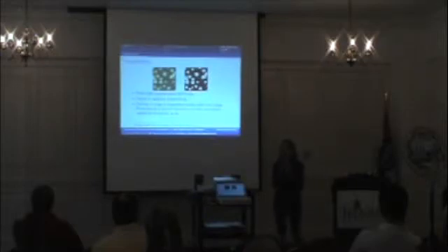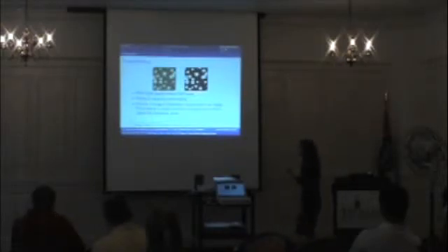So any pixels that were below that threshold level would be black, and any above that threshold level would be white. And so you can see with this, it's kind of a crude segmentation, but it kind of works. It separates out foreground and background.